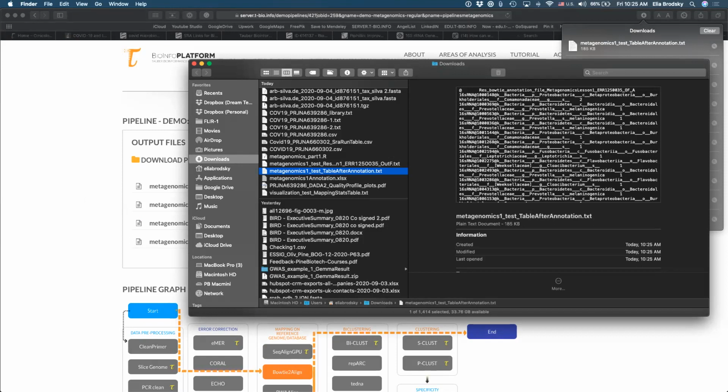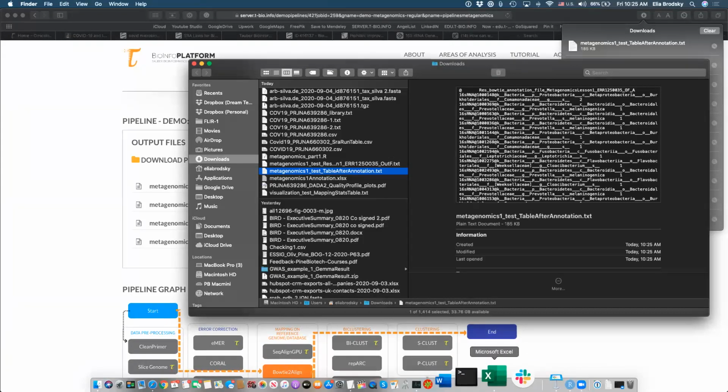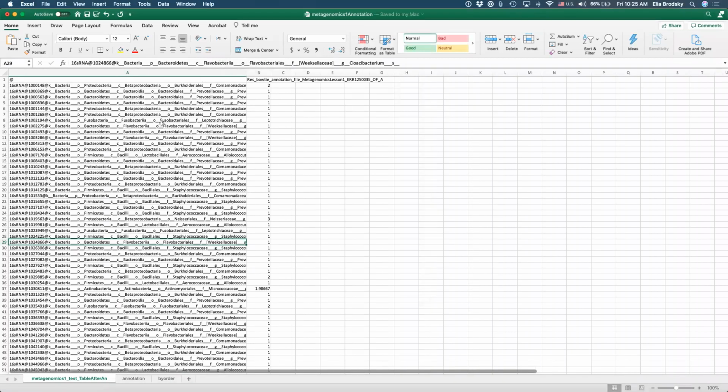All right, excellent. So let's just open this table in Excel. Okay, so just open it in Excel right now. We want to quickly take a look at what's in this table and try to organize this information in some useful way. So please open it in Excel or Numbers or whatever table manipulation software you have, or in R. Just open this table. All right, and when you have it, please let me know.